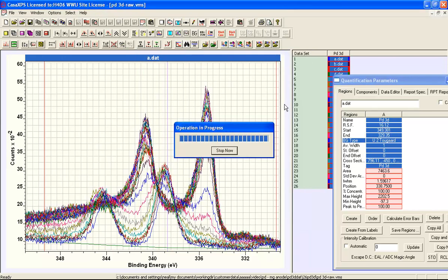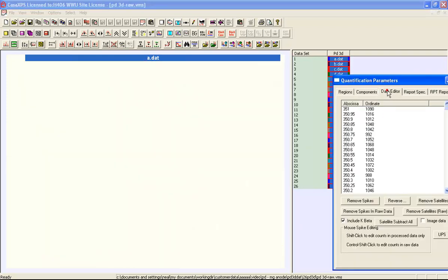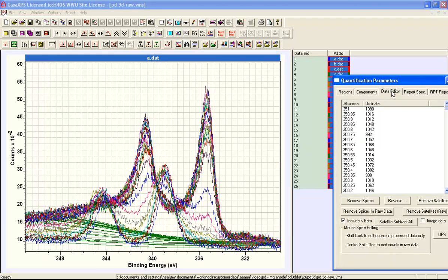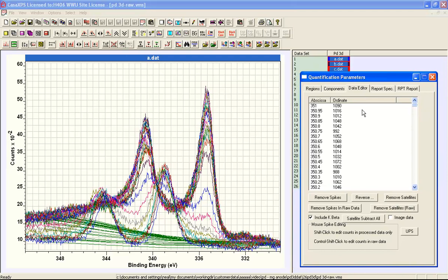So the regions now propagated to each of these spectra and back to the data editor property page there's an option here that says satellite subtract all and this will perform satellite subtraction based on regions defined on each one of these spectra.